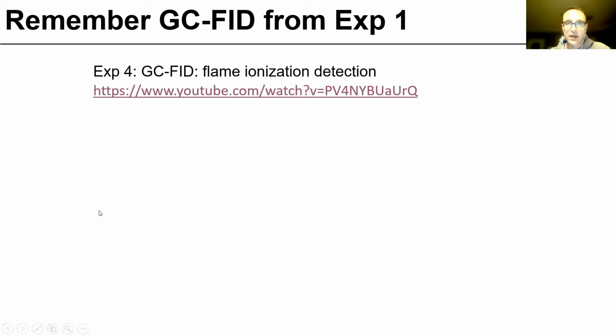All right, so I want you to remember some details about GC-FID from our first experiment. I am going to switch over and play this video that takes about 3 minutes to give you a refresher on what GC-FID is and how it works.